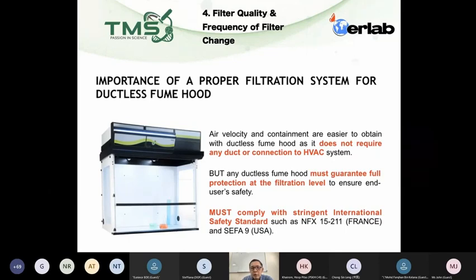All right, you should go for ducted fume hood. But if the validation came out says that your filter can last for 1 year, and the vendors should check, most of the time we will check whether the filter is saturated or not. All right, so more than 6 months or 1 year or 1 year plus, I think that is feasible. That is feasible. Okay, so I hope these parameters will help you to make wise decision.